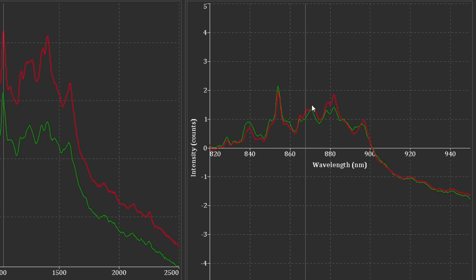I'm actually seeing a nice peak formation right there, which we saw in some prior COVID-related samples. This is something that may very well hold true and would be an important part of a measurement for COVID detection.